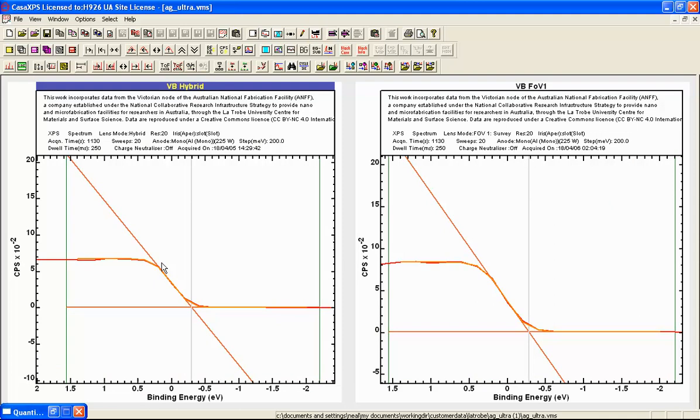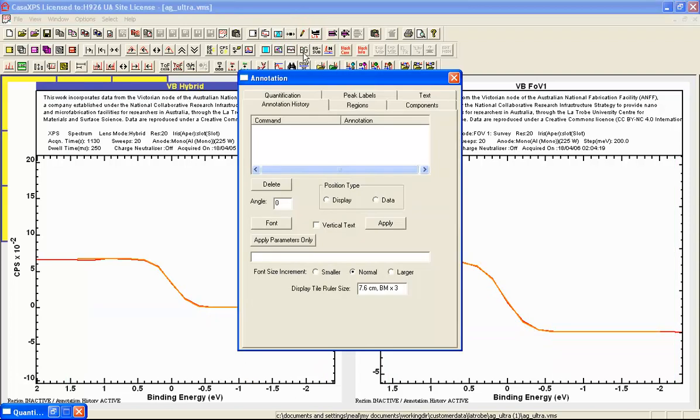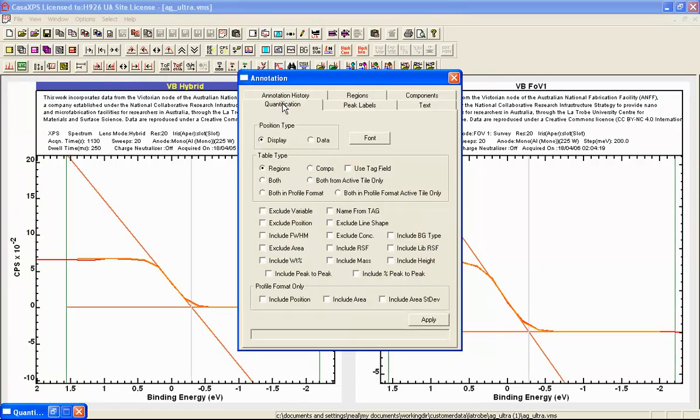So here we can see the hybrid has produced a measurement of a position and a full width at half maximum. And similarly the full width at half maximum and position for the field of view one is established. So to complete the comparison we will use the quantification tables that allow us to indicate the full width at half maximum. We might as well include the height and also we want the position.